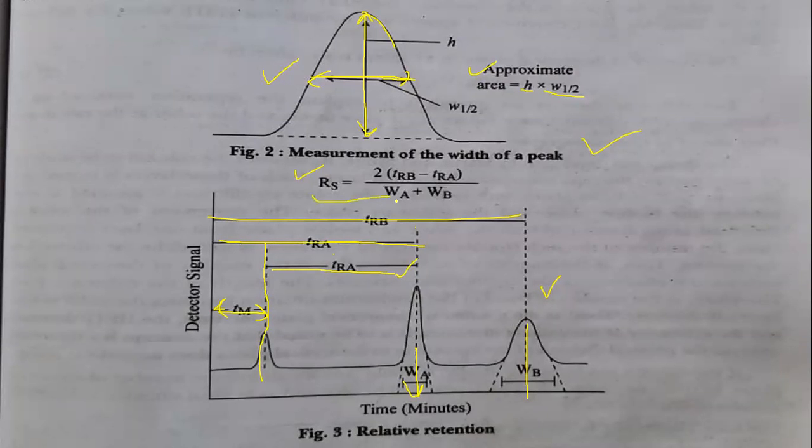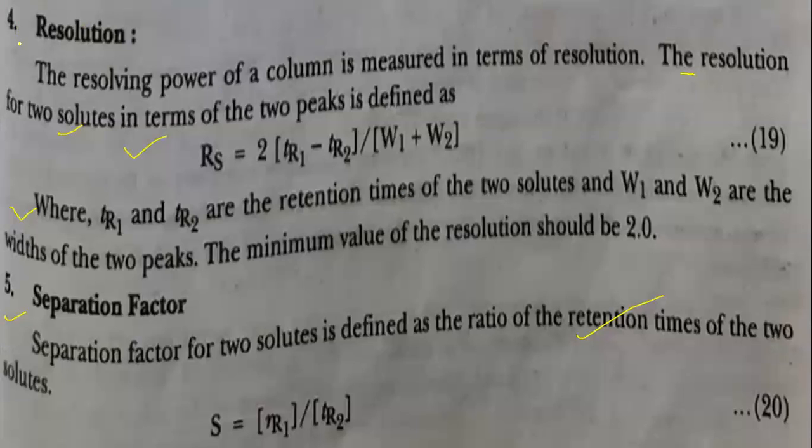Resolution, RS, is explained in the next slide. Don't worry. Resolution is the resolving power of the column, measured in terms of resolution.